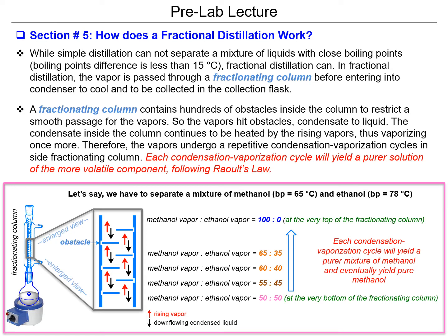So, going on to how it works, the fractioning is in order to properly separate two liquids with very similar temperatures. The fractioning column basically creates fractions, right? So you have your rising steam. It's got a mixture of solvents, right? Because they're going to boil at very similar temperatures. But then they start to condense in these little pockets on the fractioning column.